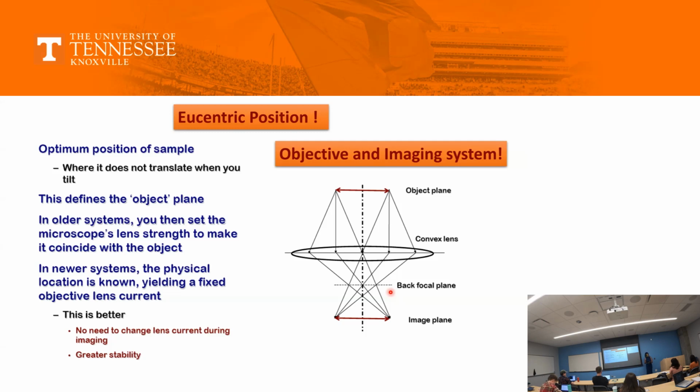Instead, for one current, which is a very small value, you can choose a particular magnification. The idea should be that you start with a very low magnification, generally 5K. When you're at a 5K magnification, you start focusing your image at a very low magnification. And then you gradually go up and change the current.